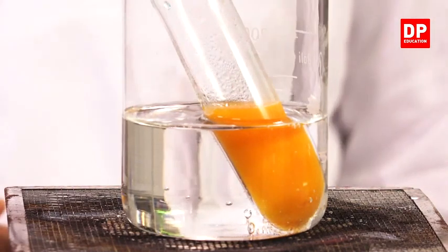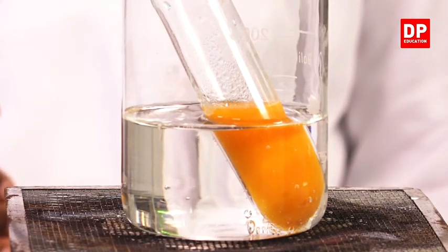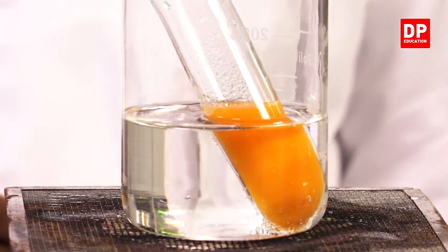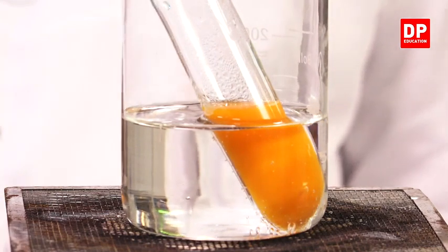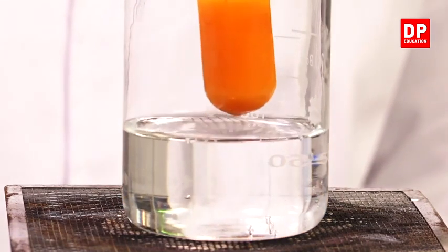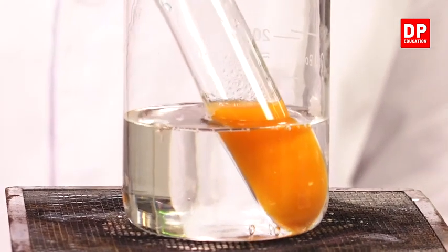You all can see the solution has turned from yellow, it has turned almost to a reddish color. You can see, students, the appearance of a brick red color.